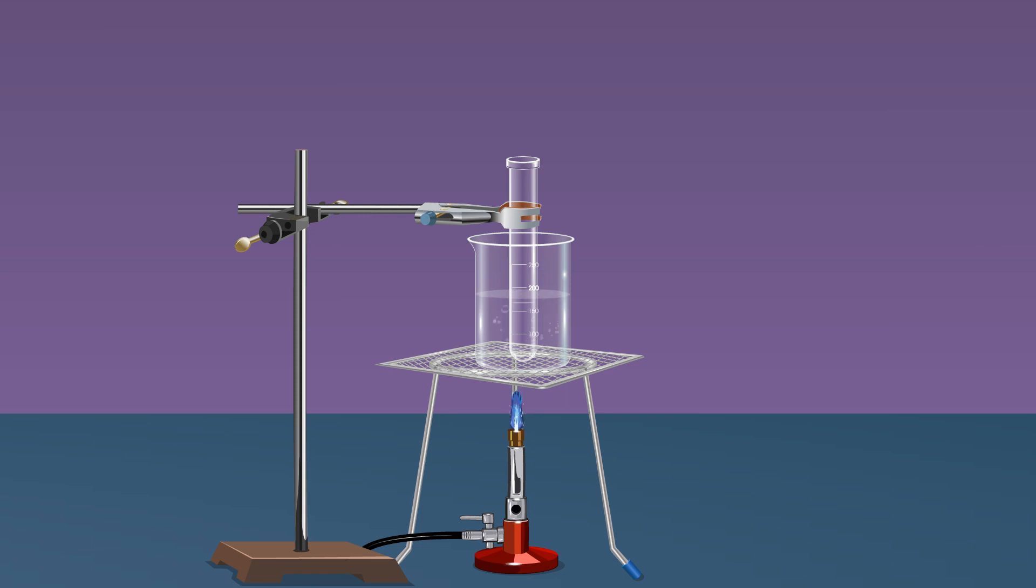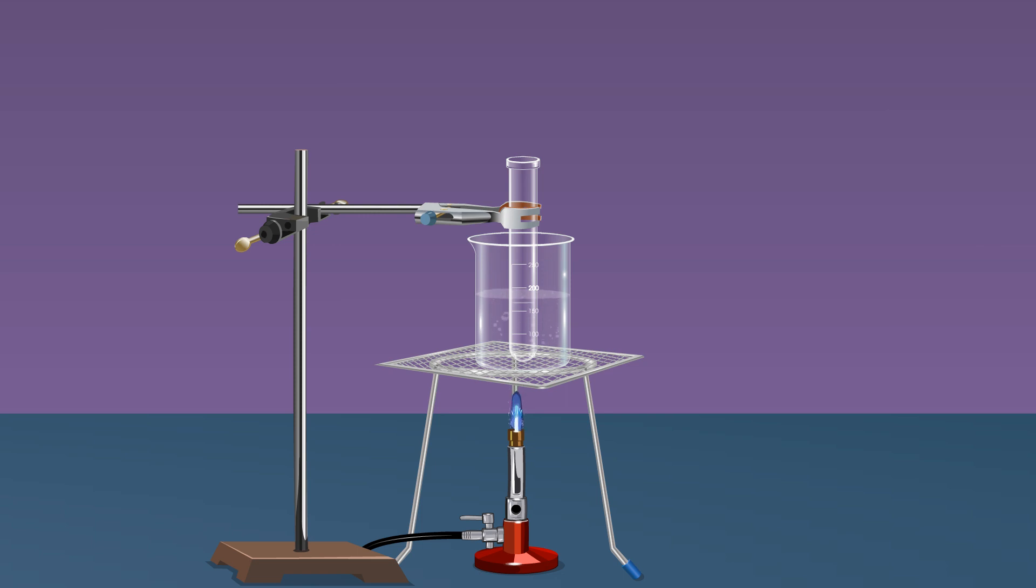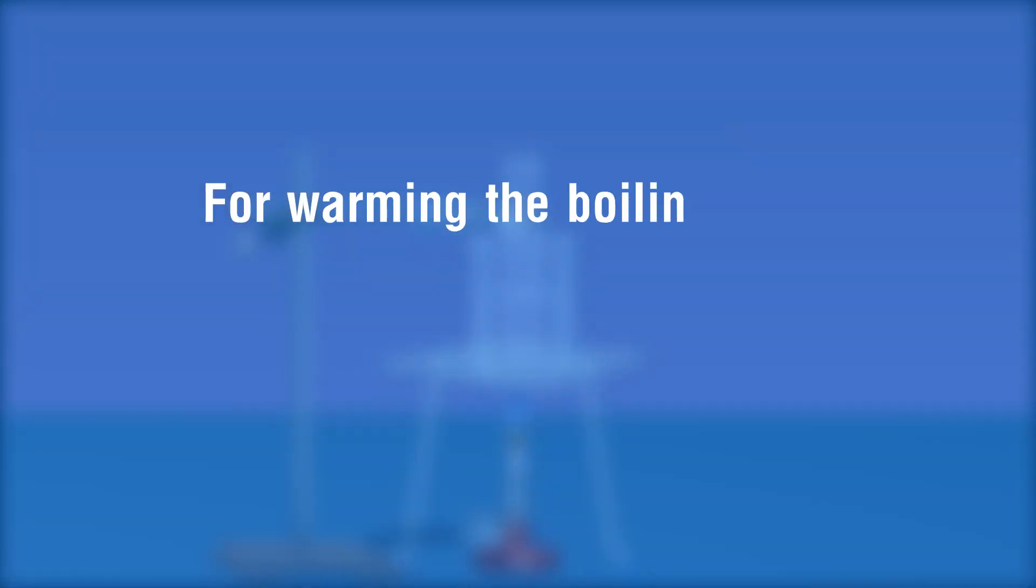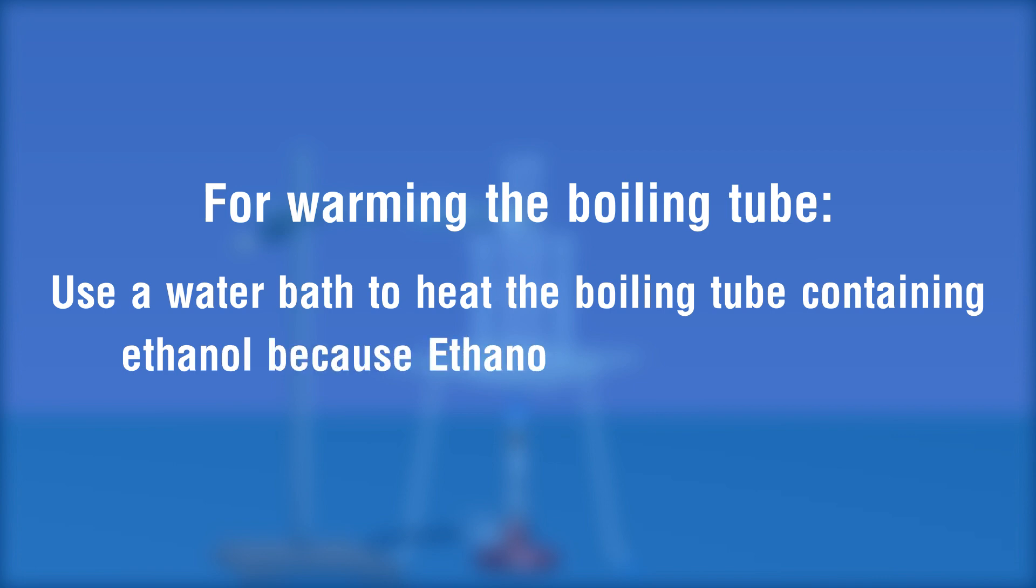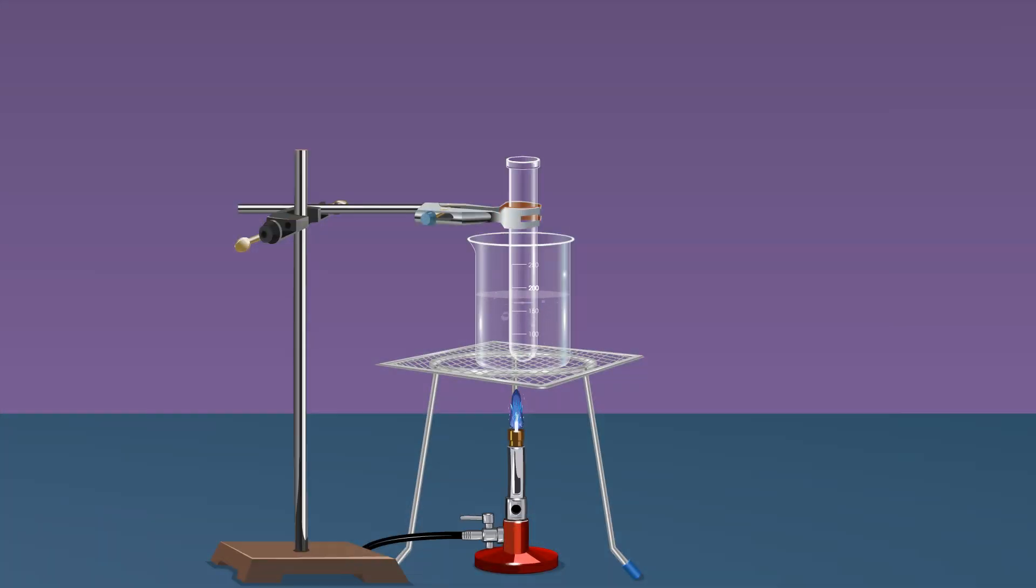For warming the boiling tube, use a water bath to heat the boiling tube containing ethanol because ethanol is highly flammable. The boiling tube containing liquid is uniformly heated or warmed in the water bath at 60 degrees Celsius. Unclamp the boiling tube from the stand and use a boiling tube holder to hold the boiling tube.